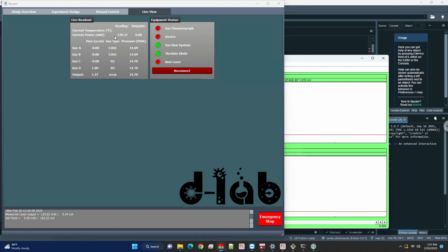You see that there's a couple of different readings that are being put out from all of our different GCs, MFCs, as well as from the diode laser, which again is set to 0 milliwatts. So the voltage reading across it is negative since it doesn't really fit into the linear calibration.